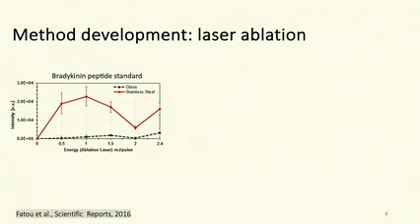But the rule of thumb here is that the more energy you apply to your sample, the higher intensities you will get. You need to be aware that although the desorption event is very energetic, you might end up with higher laser energy at very high rates of fragmentation. That's one of the limitation points. The other limitation point is that your huge desorption event might oversaturate your ionization source, which will lead to the loss of data quality in terms of repeatability and reproducibility.